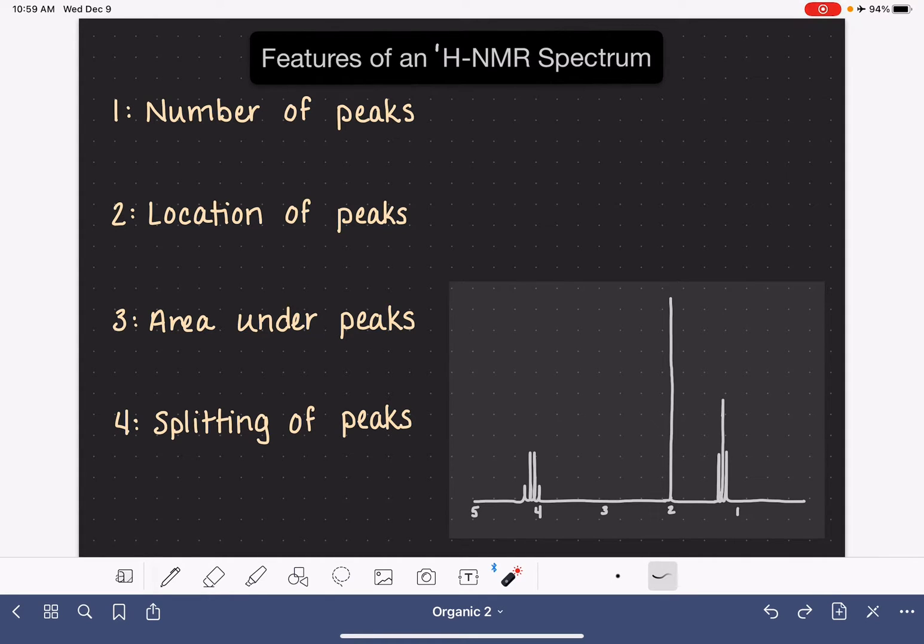So when we're analyzing a proton NMR spectrum, the first thing that we want to look at is the number of peaks in the spectrum. Each peak in a spectrum corresponds to a unique type of hydrogen atom. So the number of peaks gives us the number of unique types of hydrogens.